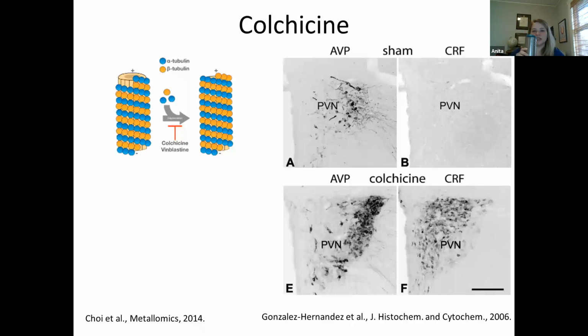And then one final thing that is really important for my lab, at least, is we look at neuropeptides quite a lot. So this is another reason you might say, oh, my antibody's not working. So neuropeptides are trafficked to axons. They're trafficked into vesicles. So we cannot see cell bodies. So there may be a reason based on cellular localization why you might not see your antibody.